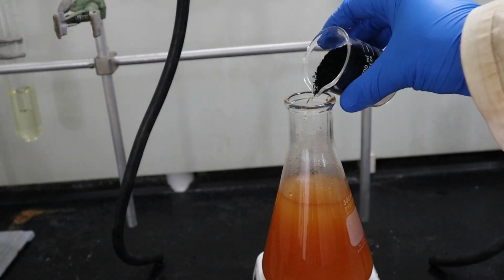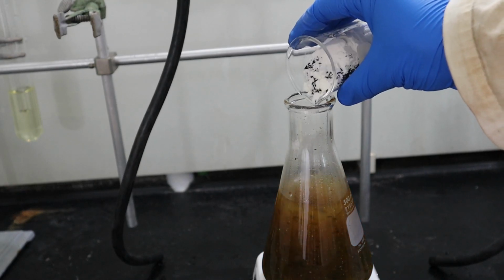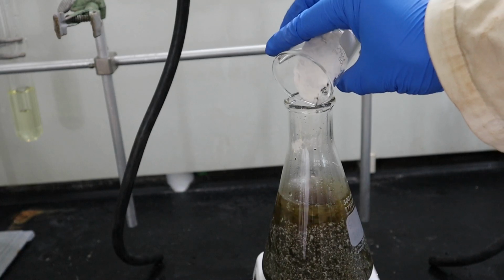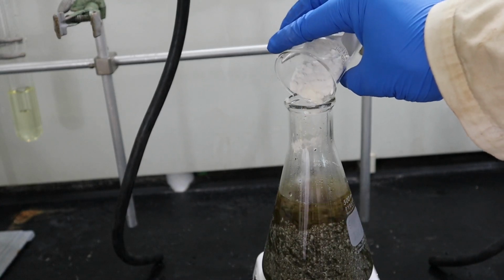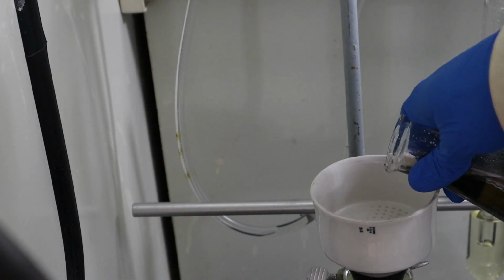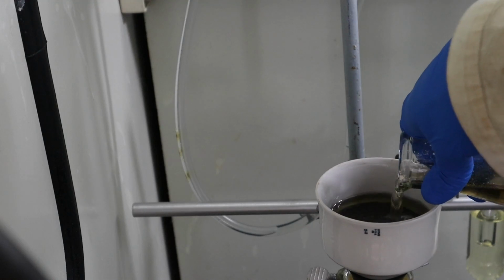I clarified the organic extract with 10 grams activated carbon and 20 grams Celite, a fine silica powder. Both have extremely high surface area and absorb impurities before being filtered off. Sodium sulfate was also added to dry the extract. I filtered the extract and washed the flask and filter cake with more DCM.